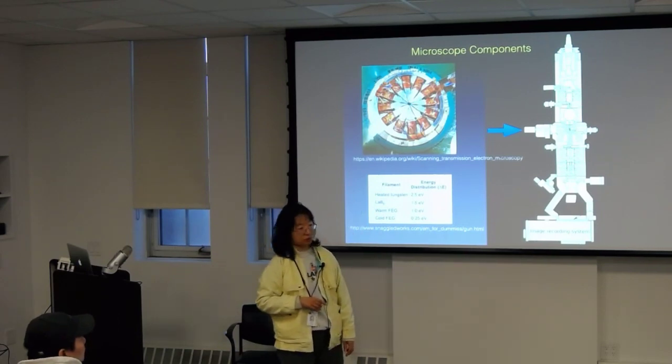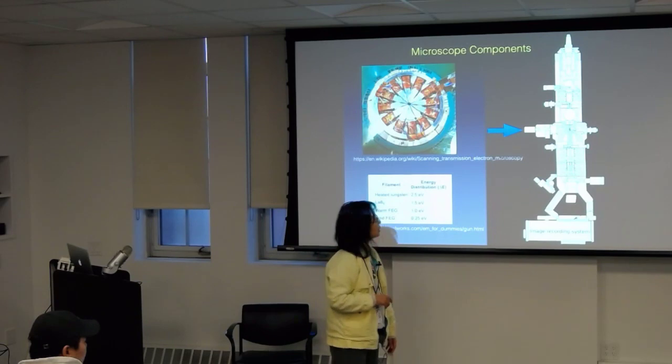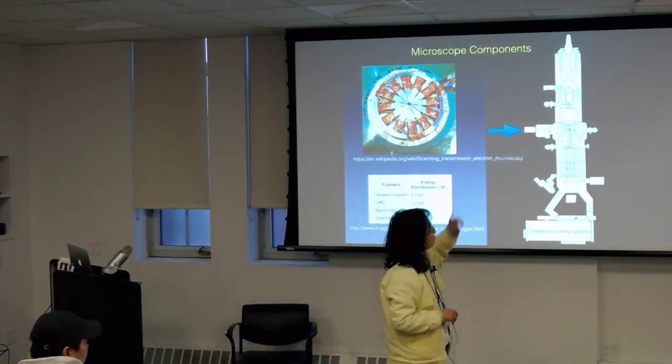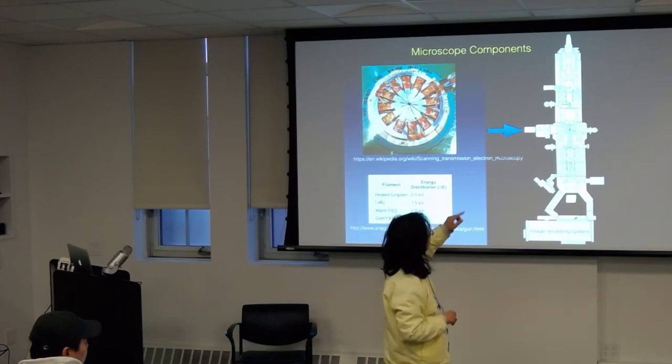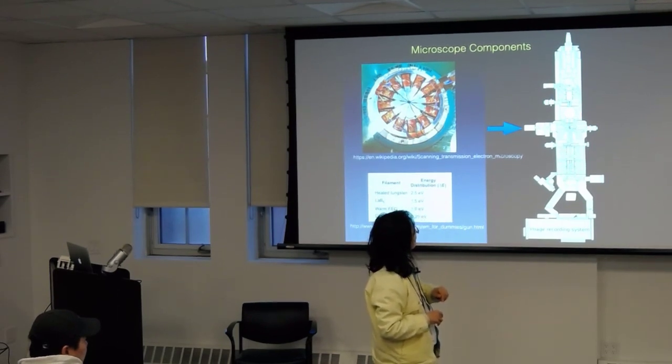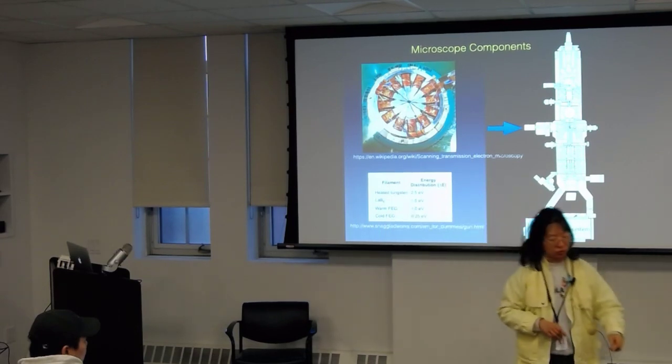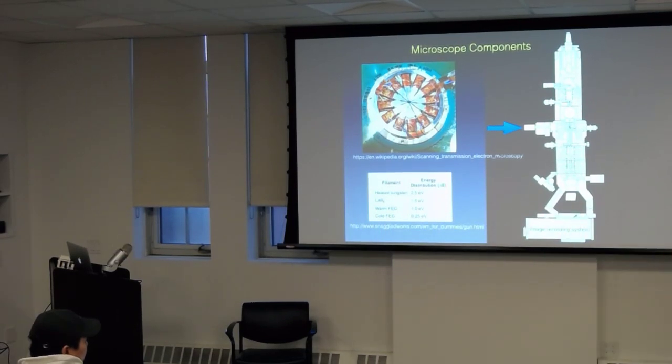That's right. That's the part that's above. Okay, that's before. So that's also related to where the gun is. So where is the gun? At the very top, right? So the very top, where they show here, with the point that's representing your source. Okay, and then after all the stacks, now you start having an aperture, right?